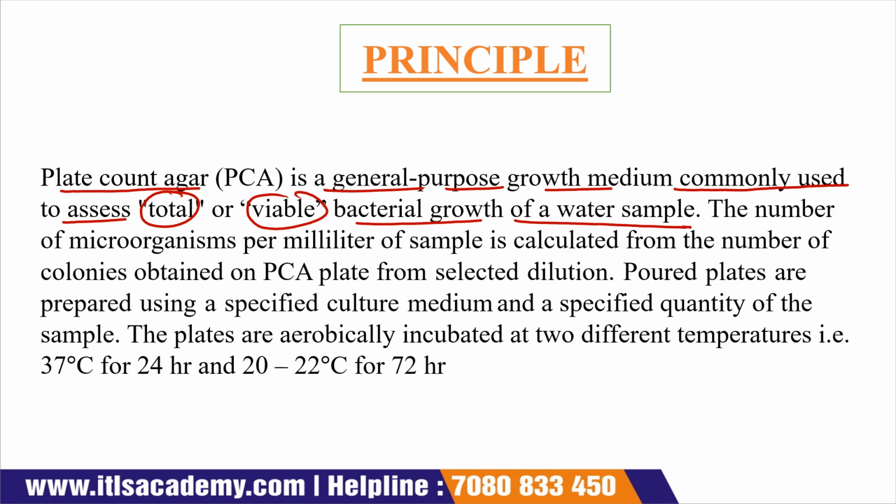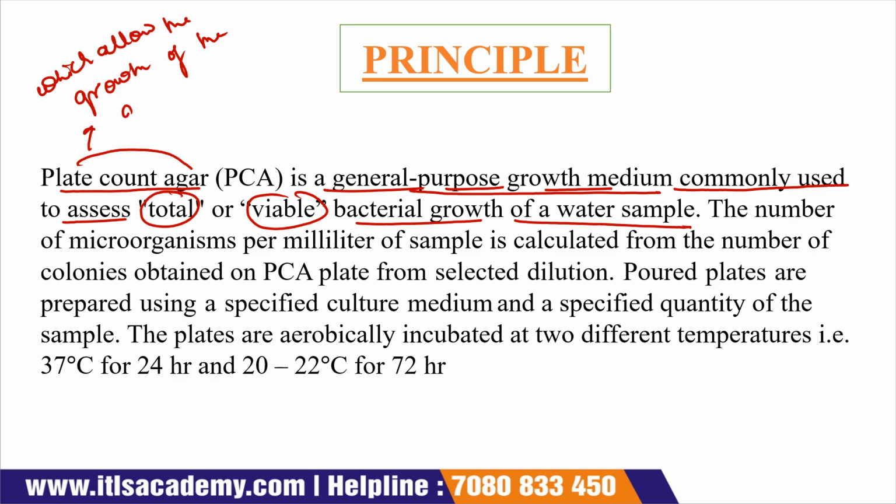It is a common type of growth media which allows the growth of all types of microorganisms, and it is commonly used to assess the total viable bacterial growth present in a sample.